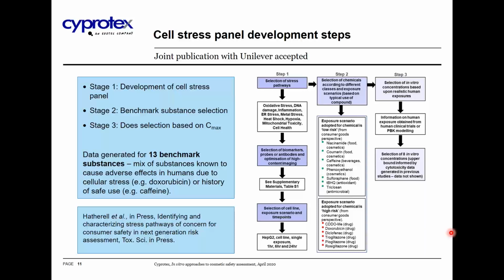And then as we moved on to establish the dose at which we would expose the cells, we did this by looking at clinical data for these chemicals and compounds, and PBK modeling to establish Cmax concentration. And this work is also in press and should be available soon.